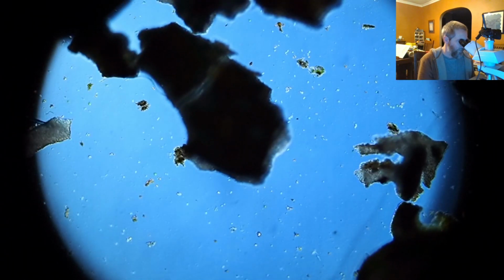let's jump back out to the 10x so you can kind of see the larger stuff in focus without me having to scramble around the sizes. If we find another one, I might try to zoom in on it. For some samples, they're all over the place, and I just haven't seen very much in this one that's like that. Just that one, for sure. So water bear, that's the one that we were seeing before. I don't think any of them are new at this point.